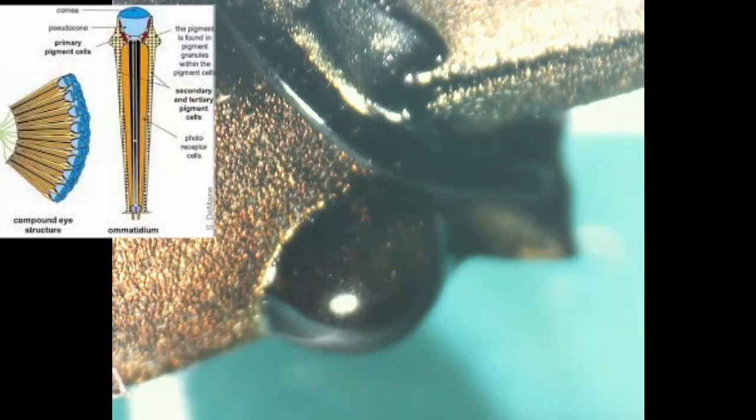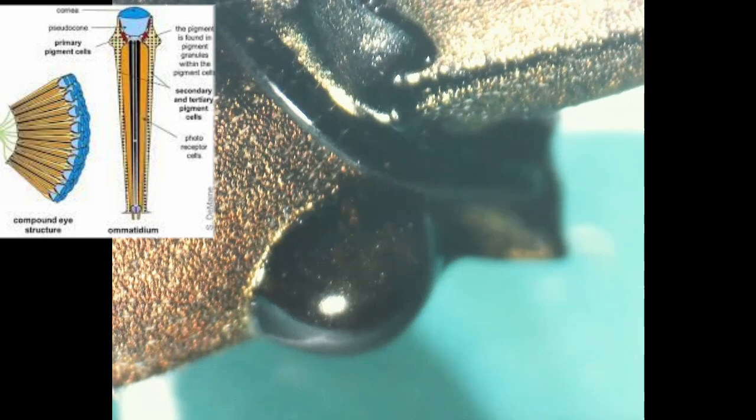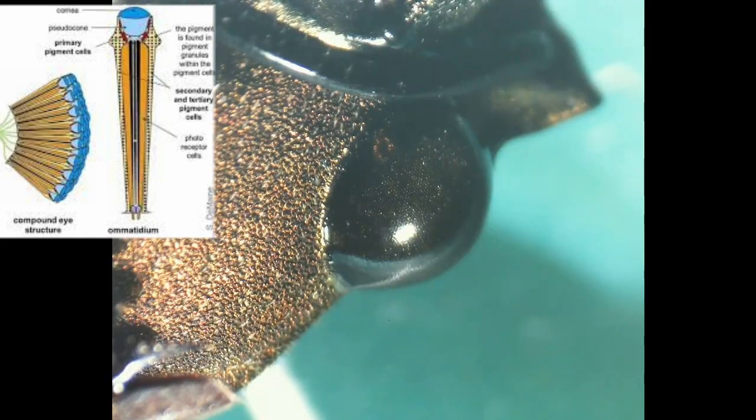Look closely — appreciate the tiny components we call ommatidia. You are looking directly at their corneas, which refract light into the photoreceptors. Unlike human eyes, ommatidia tend not to have separate lenses.